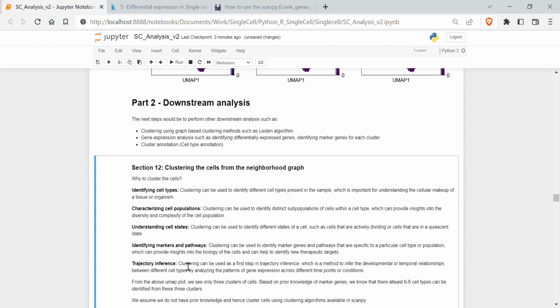Also, what makes the difference between cell type A and cell type B is that some of the genes are expressed in cell type A and some in cell type B. So there must definitely have been an overlapping process between the two cells. So we want to see how cell type A has become cell type B.